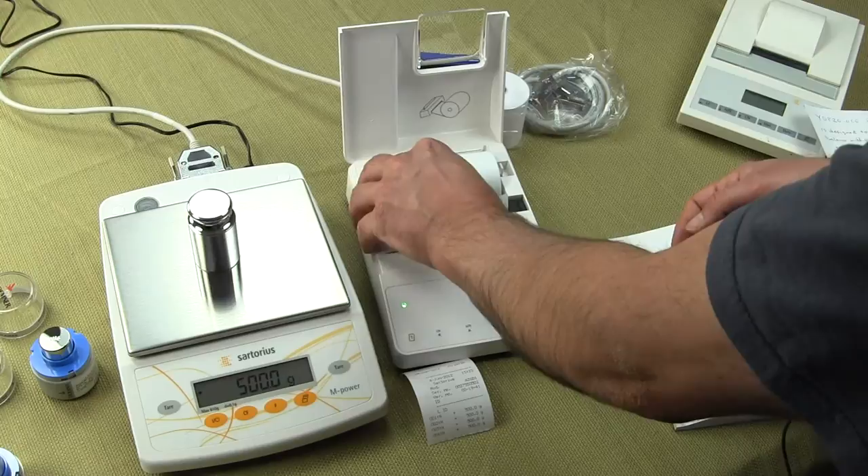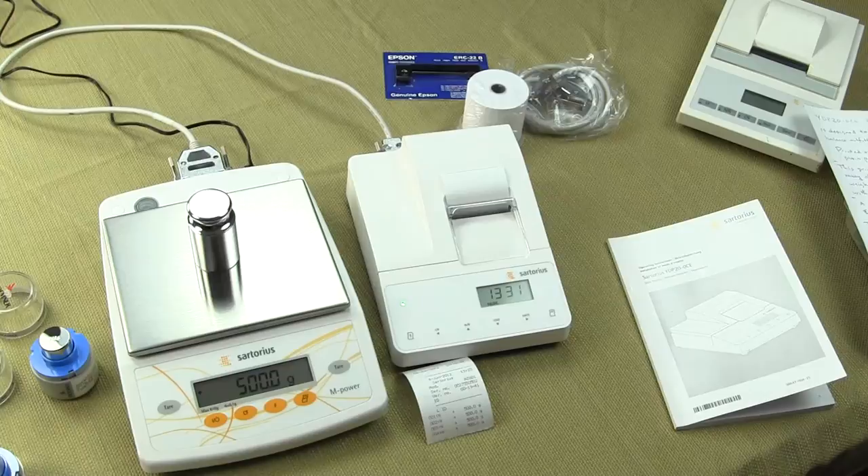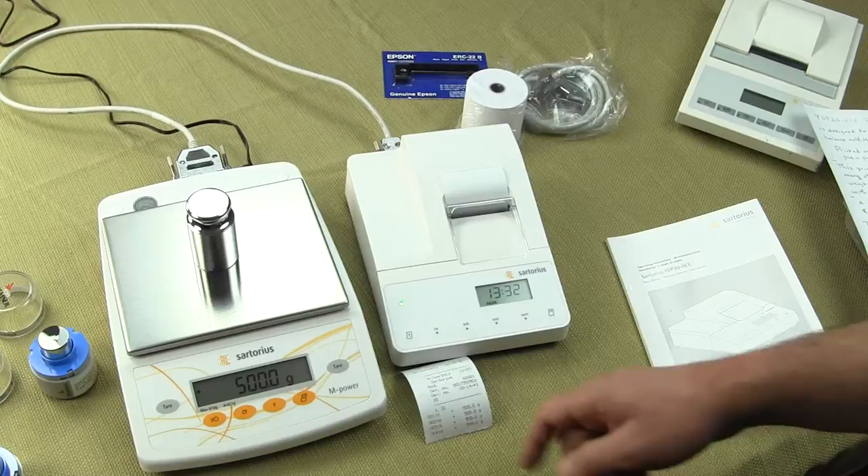When you buy the printer, the rechargeable batteries come with it standard. Our printer paper is installed, and we're just pressing the line feed here so I can feed the paper back through. This is the brand new Sartorius YDP-20 OCE printer.